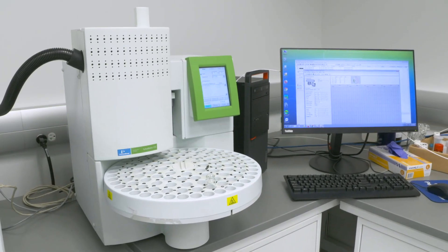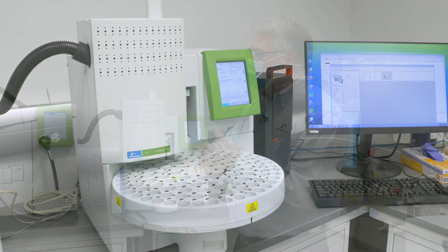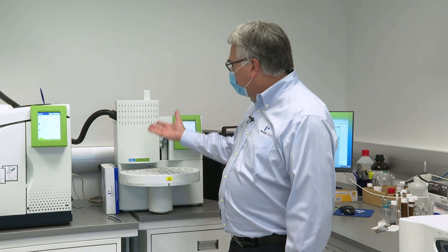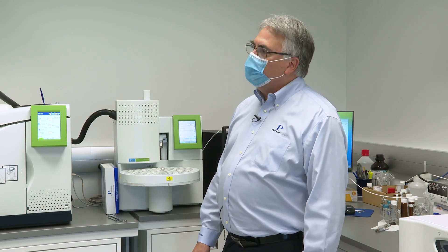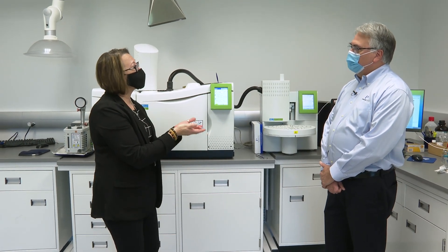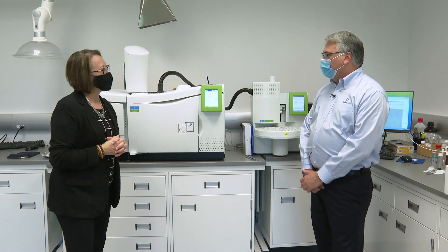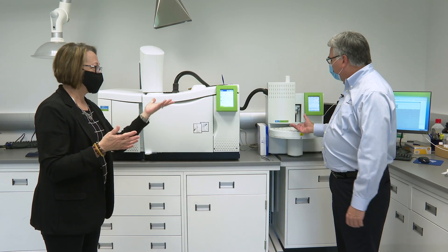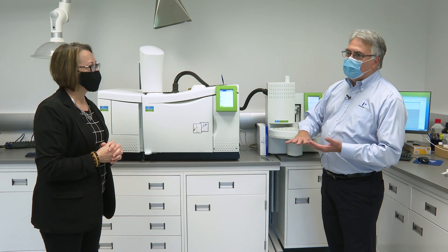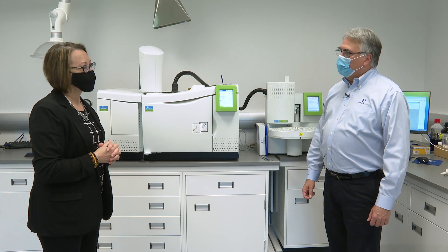Headspace was originally designed for blood alcohol testing — drunk driving. If you drink alcohol and get into an accident, Headspace GC is the traditional gold standard means of testing. Why Headspace? Because you don't necessarily want that biological gunk going into the instrument — it's only analyzing the volatile components coming out of the blood. You could inject blood into the GC once or twice, but with Headspace you can inject the volatile components of the blood, leave the blood behind, check the volatile ethanol, and do that hundreds of times with great results.